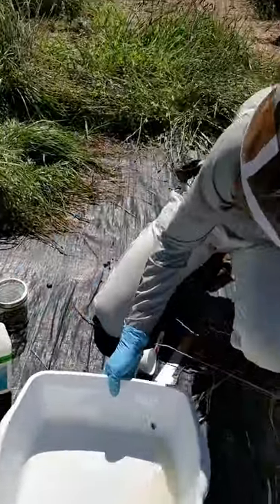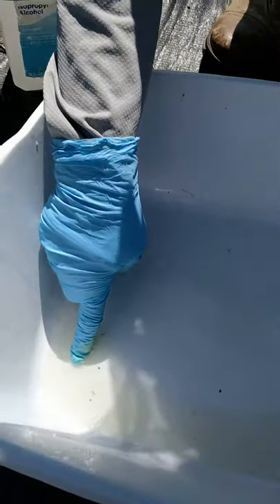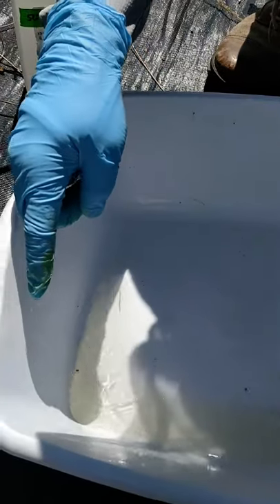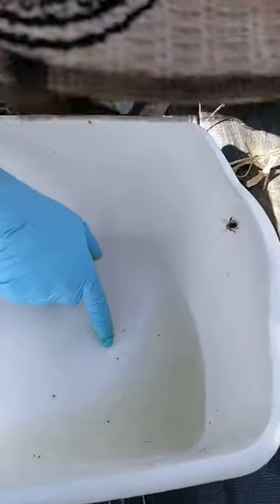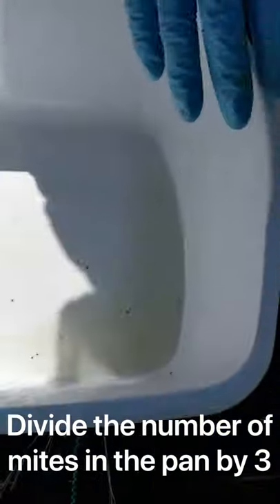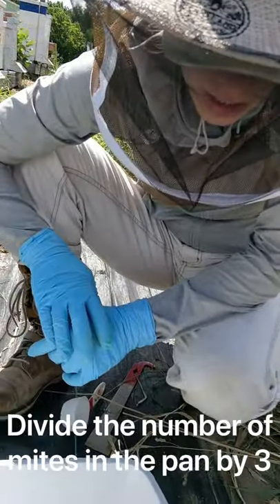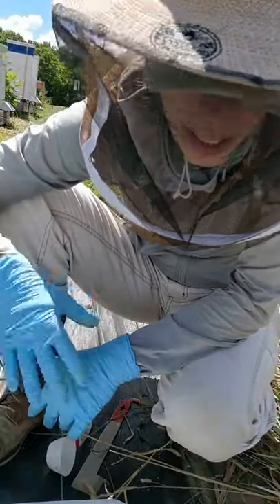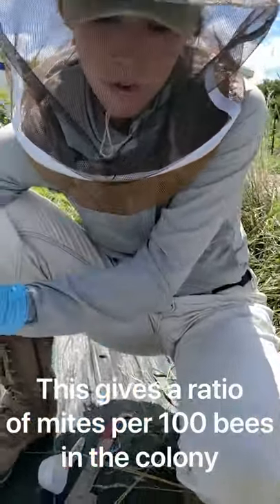Now we can look in the bin and count. There's a mite here — one, two, three, four, five mites in here. So what you're going to do with that number is take it and divide by three. Five divided by three is a little bit less than two, and that's how we get our ratio of mites per 100 bees. So we have a little bit less than two mites per 100 bees.